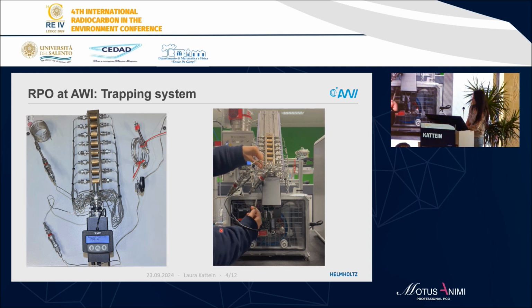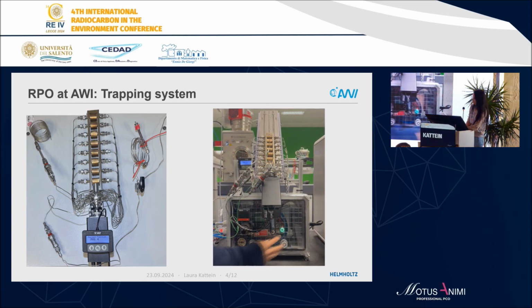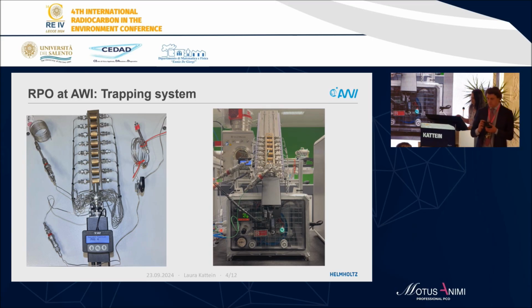Put a thermocouple in front of the heating system. Then we turn on the power and the air that is used for heating and cooling. And then I move from the waste trap to the first trap. And then I start the heater, and you can't actually see it right because I'm holding the cable in front of it. But I will move it in a second. So now you can see the heater is working pretty quickly. We reach 400 degrees in about 1 minute.